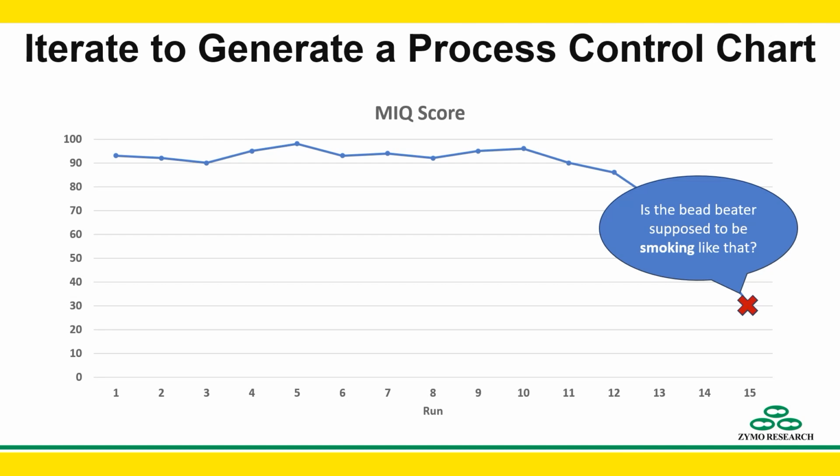We actually can't say because it's in the normal range, even though it is on the decline. Run 12 was most likely the first run where we can say this was really affected. And beyond that, we're definitely in the decline, no question about it. And just for safety's sake, since run 10 looks like it was clearly not part of the decline, we were able to say, let's repeat run 11 and everything beyond that, just to be sure that we don't have any data that was affected by the failing machine.